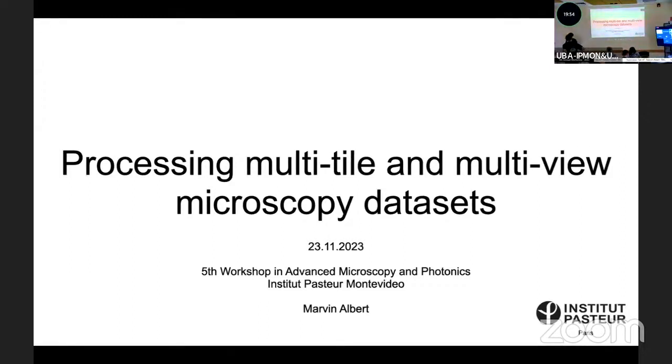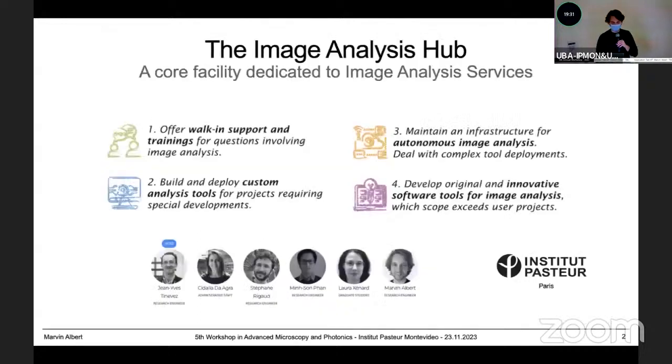That's really nice. And exactly, I work, as Leonel was saying, at the Institut Pasteur, but in Paris. And my background is in physics. I actually studied 2 semesters in Buenos Aires, close to here. So I'm also really happy to be close to there. And now I work in a so-called image analysis hub. That's how our group is called. And basically, we are a core facility that is dedicated to performing image analysis services.